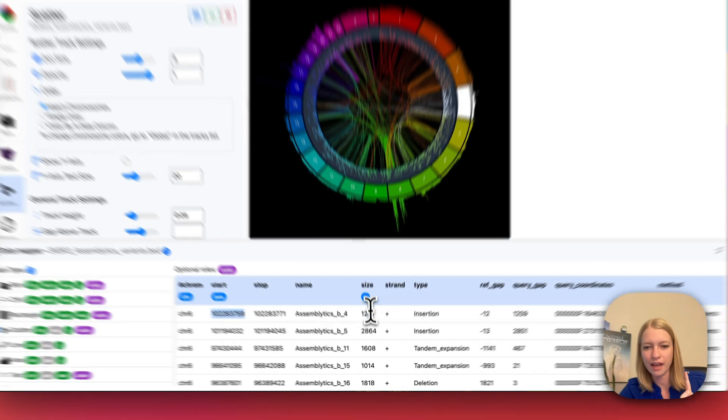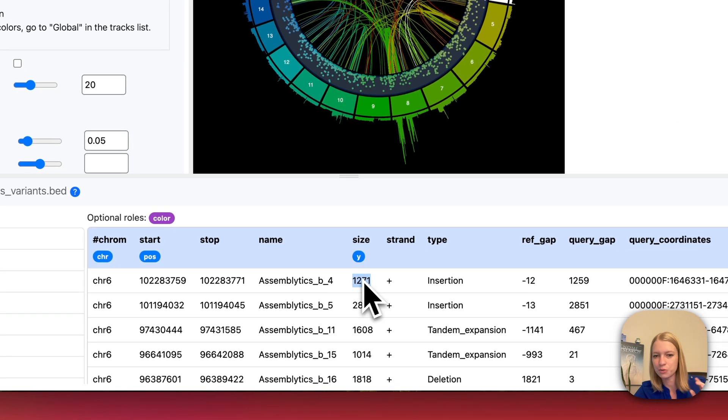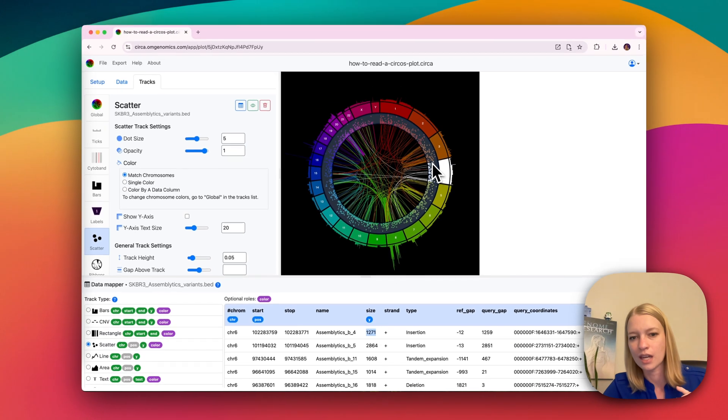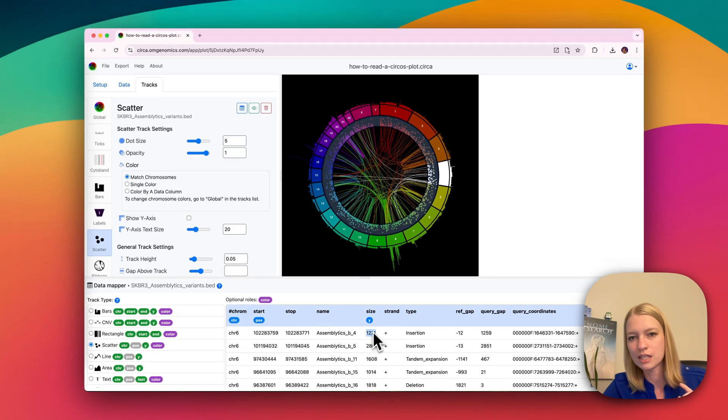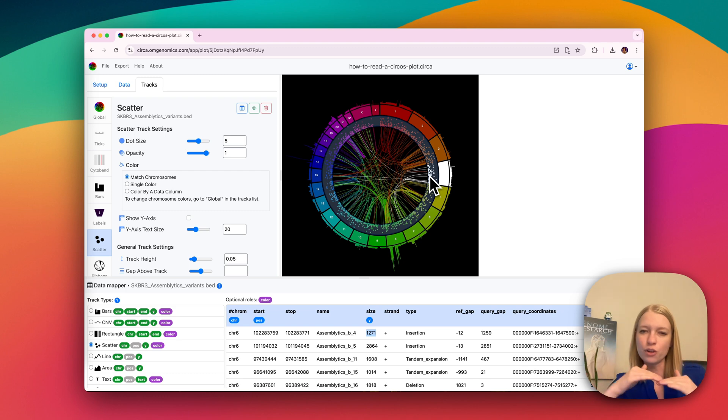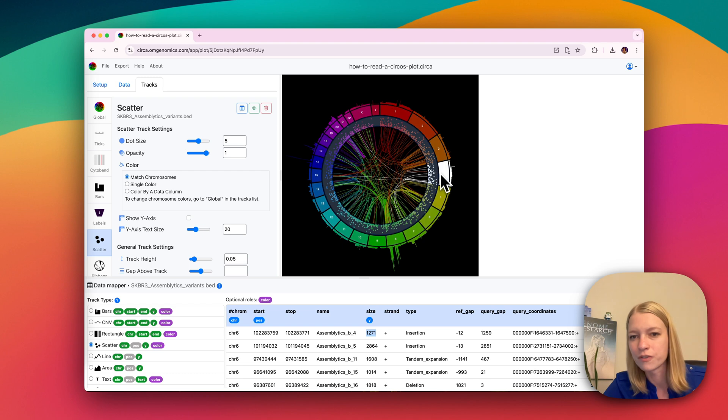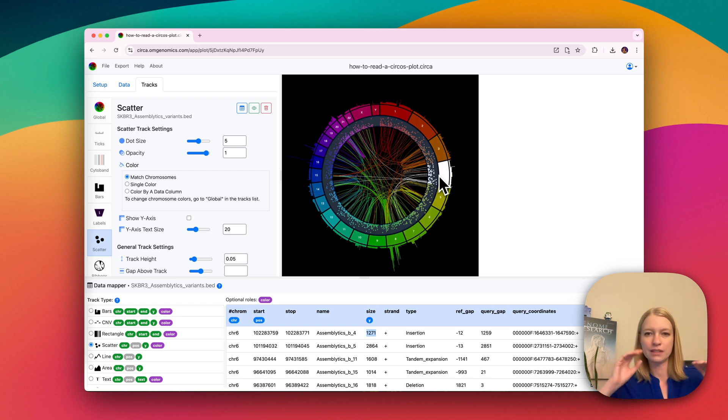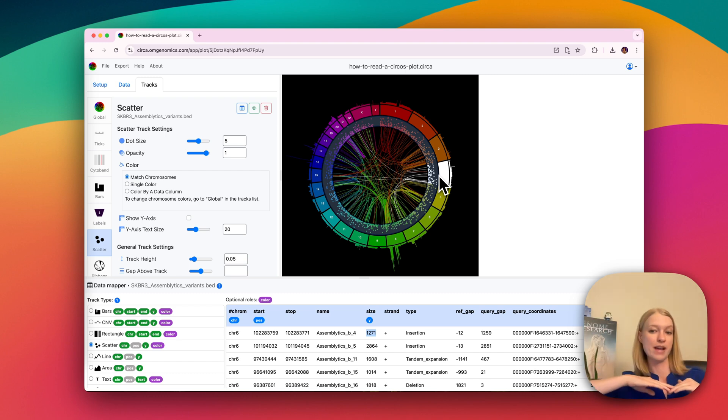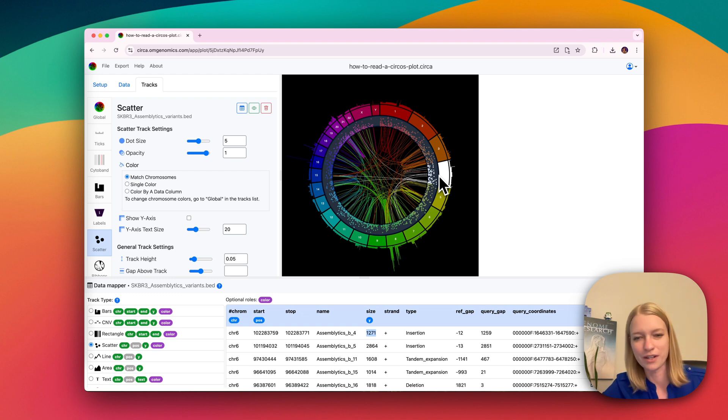And then you're also going to have for a scatterplot like this, you'll have a Y position. And this is a number in this case that will tell you if the number is lower, it's going to be closer to the center of the circle, like over here. And if the number is higher, it'll be farther away from the center of the circle. So basically think of far away as being the same as up on a normal Y axis on a normal type of plot that you're going to make anywhere else.